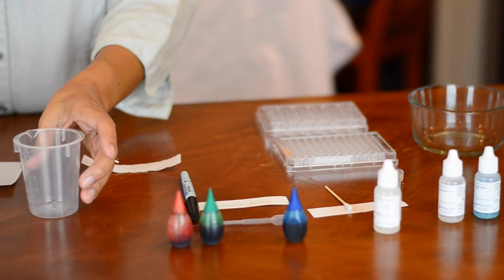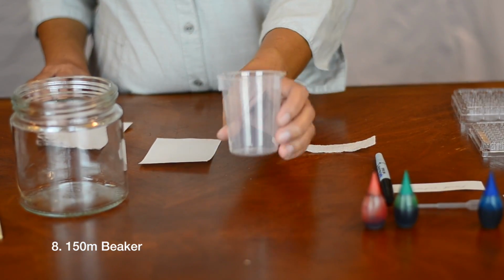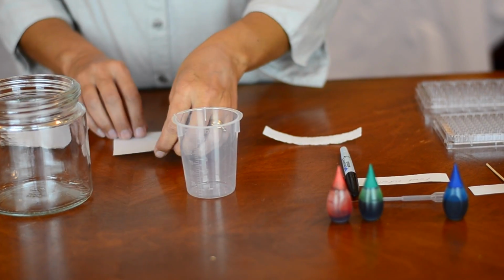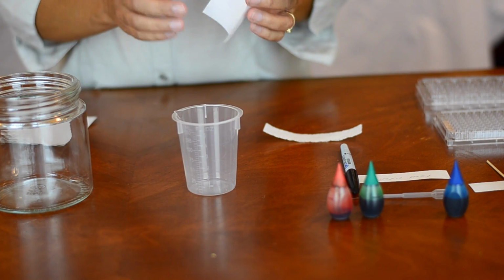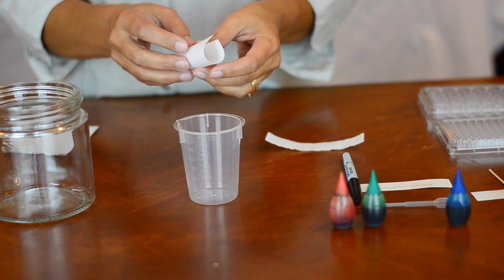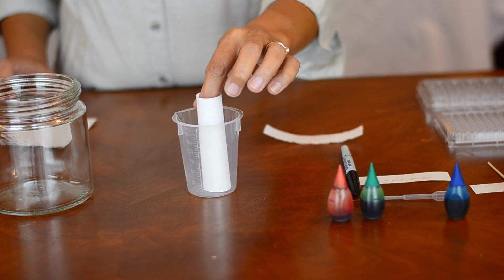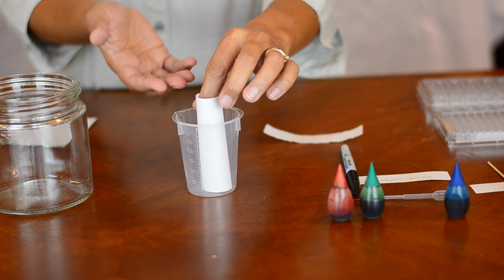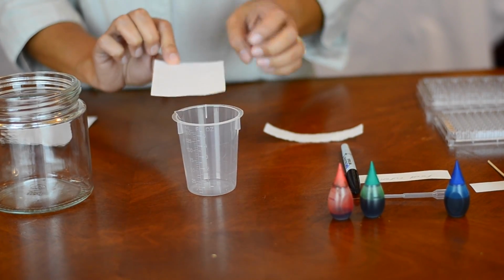Sliding over here now to more of our equipment. This is the 150 ml beaker that your book, the manual, suggests you use. Basically what we're going to be doing is putting our reagents on the bottom of this paper, wrapping that up, stapling it together, and then dropping it inside this beaker for the distilled water to wick up the paper and move our reagents across the paper. So you can go ahead and do it that way.